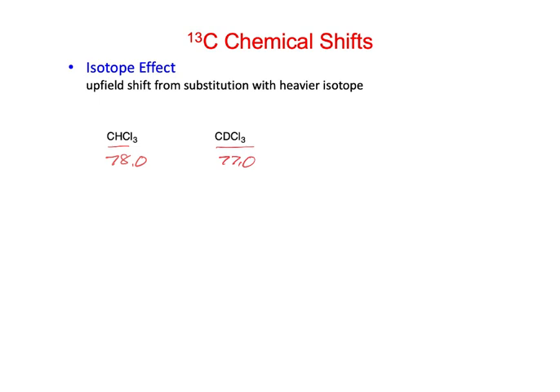And the way you might see this in the spectrum, we talked about this already, is the deuterated chloroform has 3 peaks. Remember why? 2nI plus 1. Right, because there was this equation, the 2nI plus 1, which was a more correct version of the n plus 1 rule. So normally with C13 or protons, because I is 1/2, that 2 and the 1/2 essentially cancel each other out, and we have n plus 1.